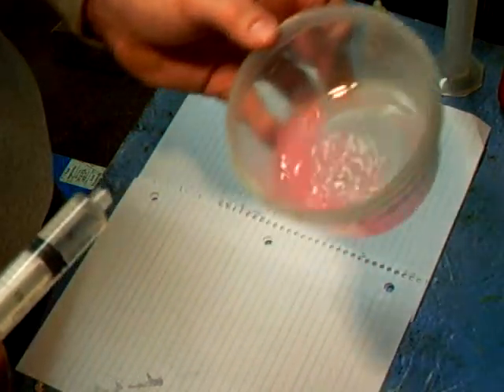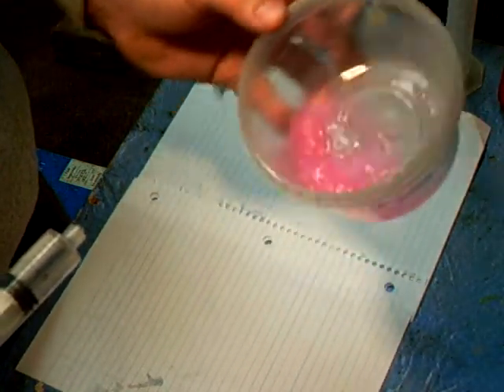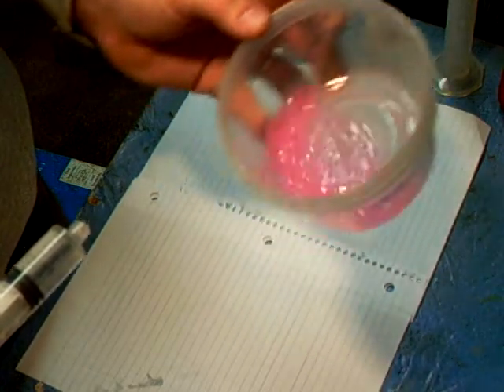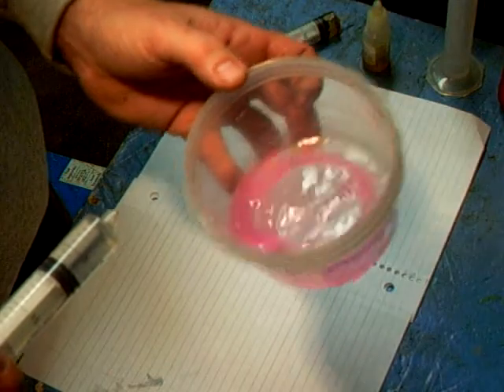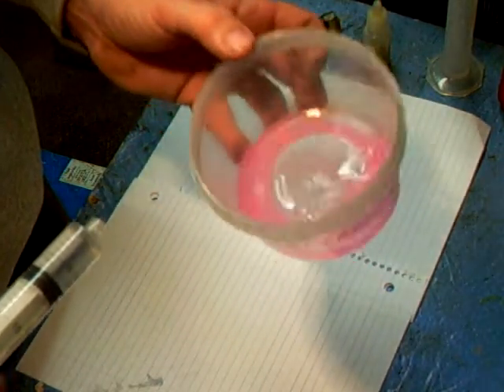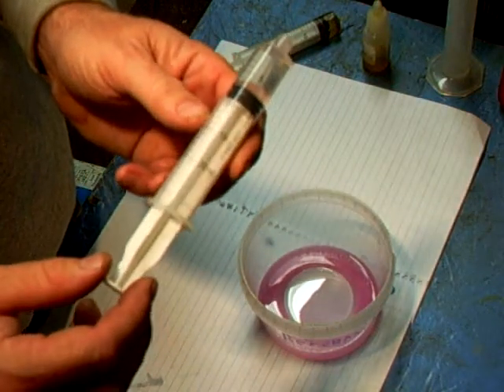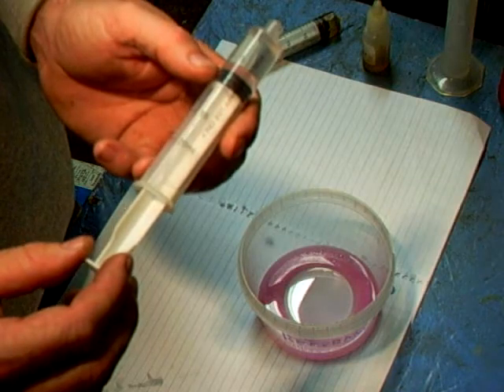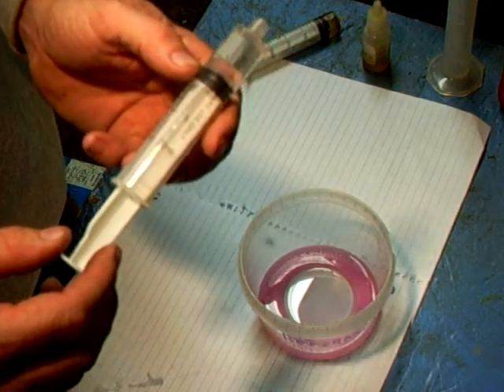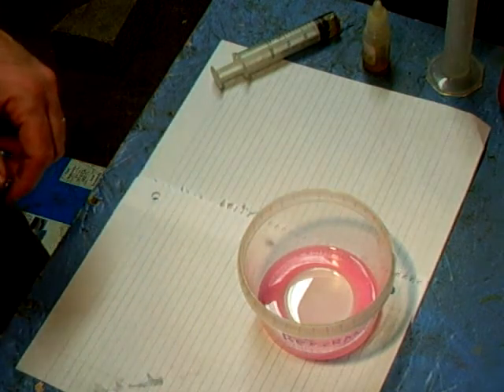It's starting to lose color. Let's add a couple more drops. There, we go back to a good solid color. So we'll call this good. Now go back to the syringe and figure out — we used one, two — we used three milliliters of reference solution to neutralize the oil.